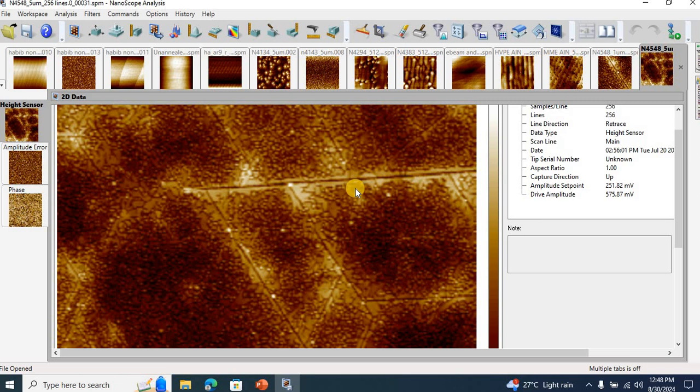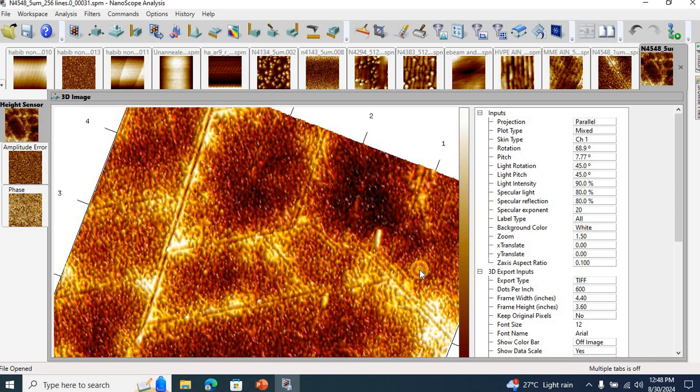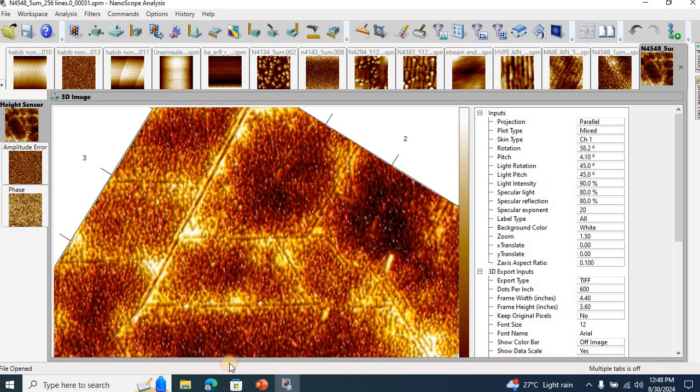So an aluminum nitride film with thickness greater than a couple of nanometers would result in either cracking if we are growing it under high crystalline growth conditions, or a high defect density under low quality growth conditions. So we see these cracks on top of the surface as well, and here is a 3-dimensional image.